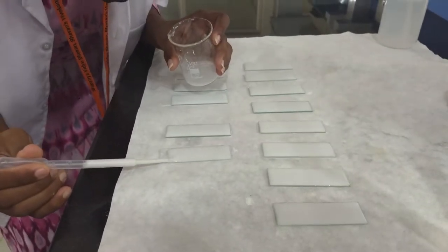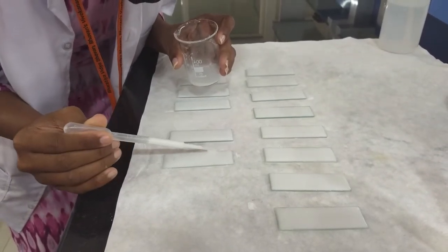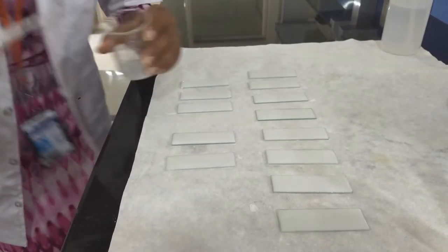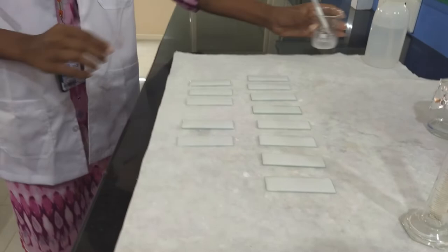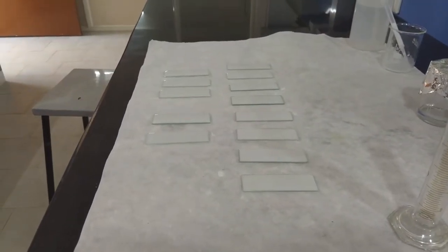After coating all the plates, leave them aside for 10 minutes for air drying. After that, transfer all the plates into a preheated oven set at 100 degrees centigrade for 1 hour so that the plates become activated.